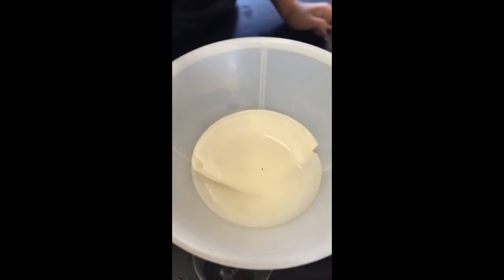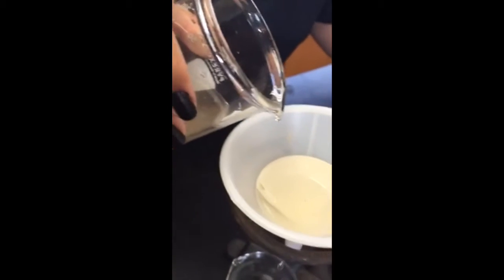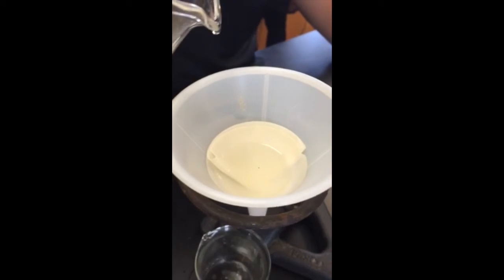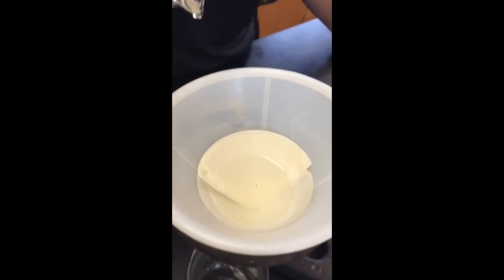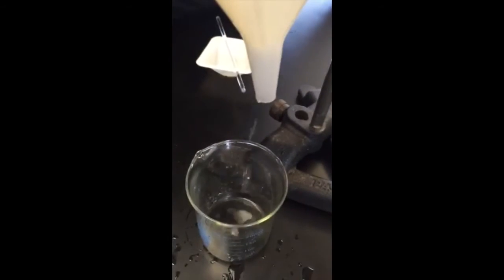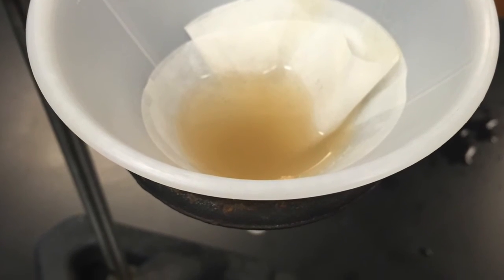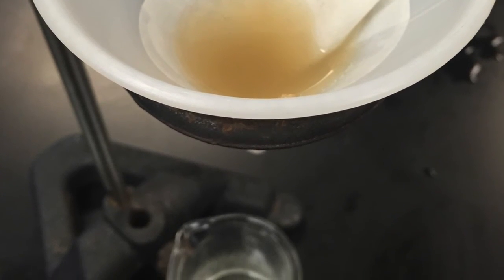Eventually, all the water will drip into the beaker, and I am left with sand in the funnel paper and water in the beaker.